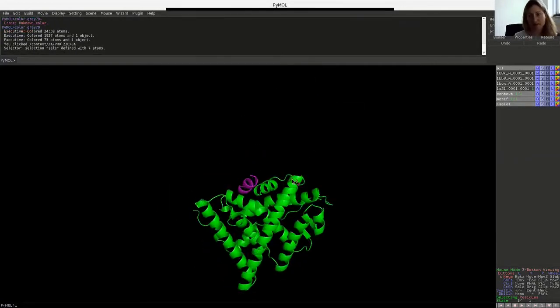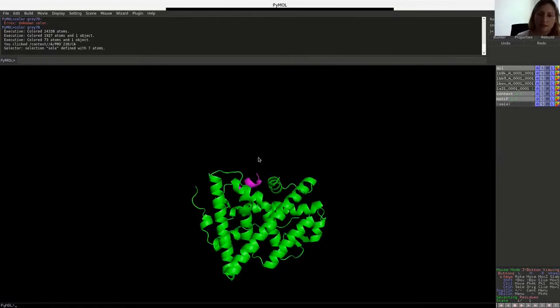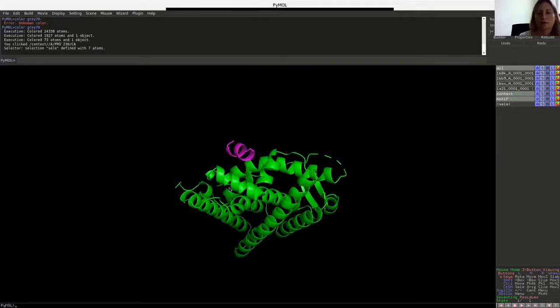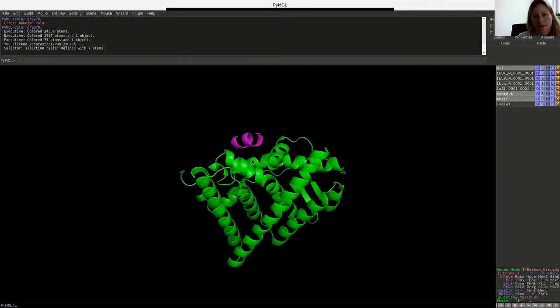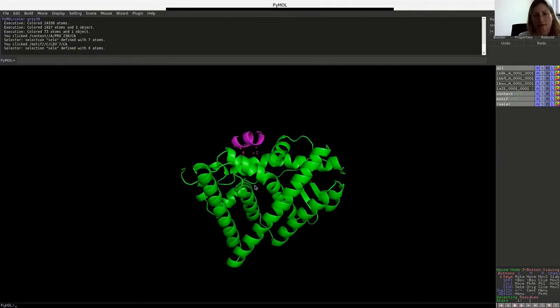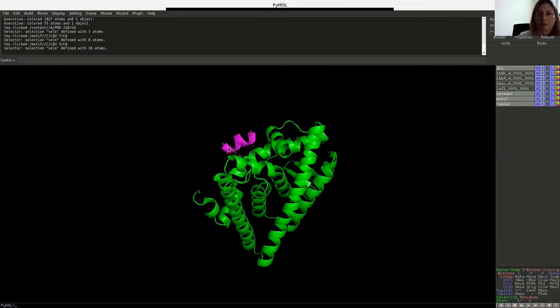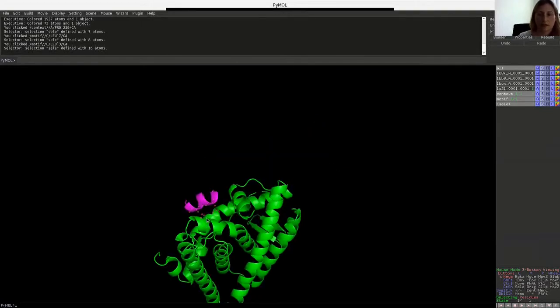just as a reminder, we are still working with this estrogen receptor structure where we have this one copy of the dimer bound to this peptide with these interacting residues here. And you saw in sidechain grafting how we transferred these two residues into helical stretches mostly. Here we expect this part to be grafted, but we're not so much restricted on what kind of backbone. So it's going to be interesting to see how this is going to look.